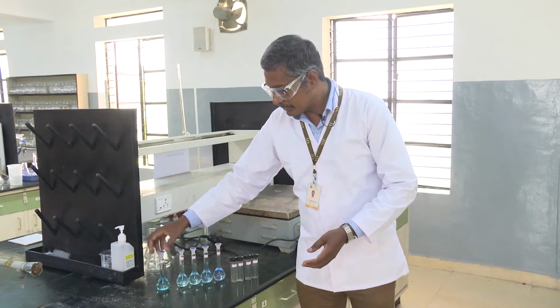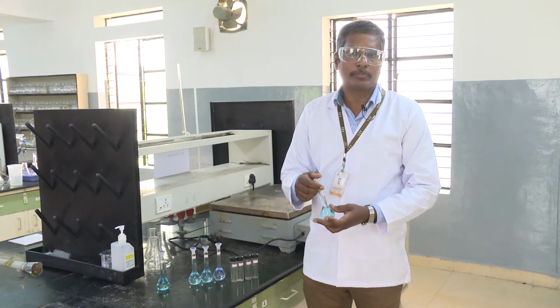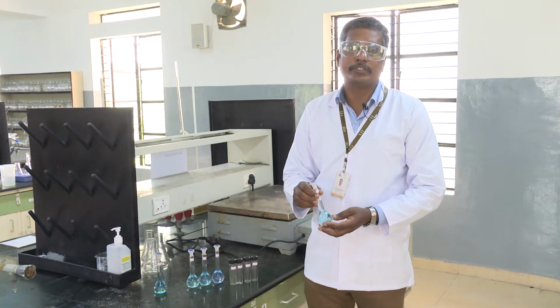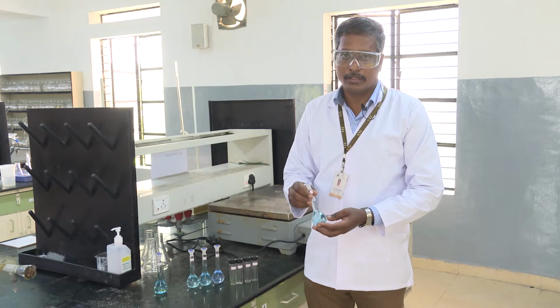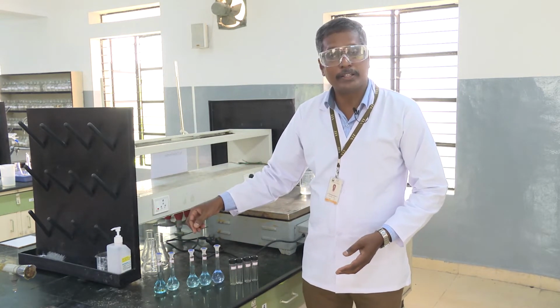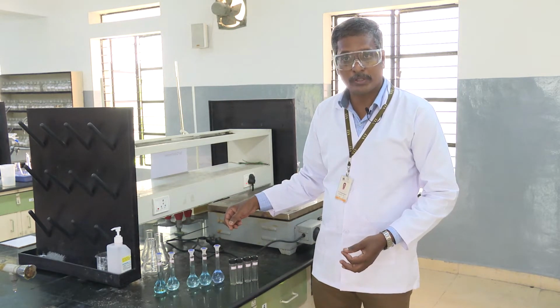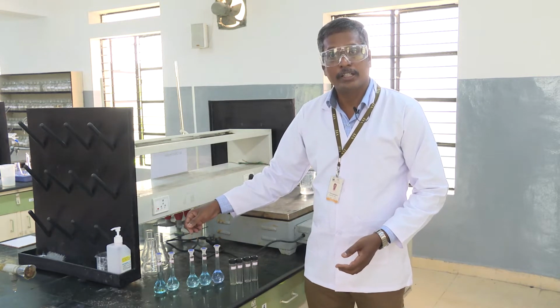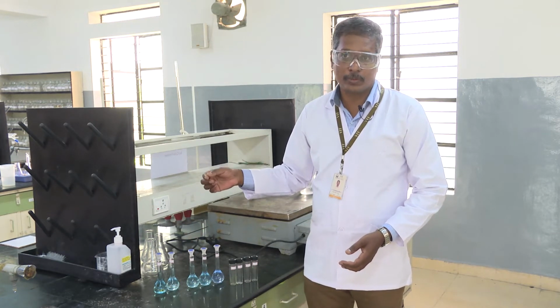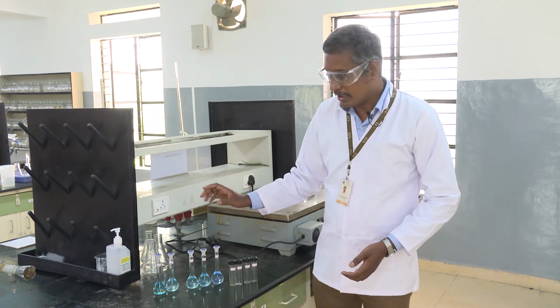And then going to the second sample, which contains 0.5 ml of Benedict, 4.5 ml of glucose, and then 45 ml of 0.0001 molar sodium hydroxide solution. Likewise, both the glucose and the Benedict are in the same volumes, 0.5 and 4.5, and we just vary the 45 ml of sodium hydroxide solution from 0.001, 0.01 and then 0.1. Okay, so now we have the 50 ml of that.